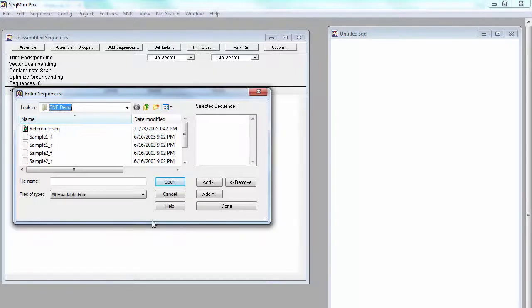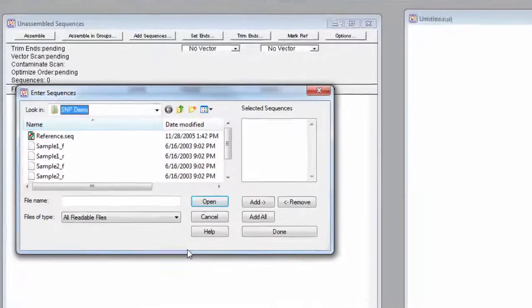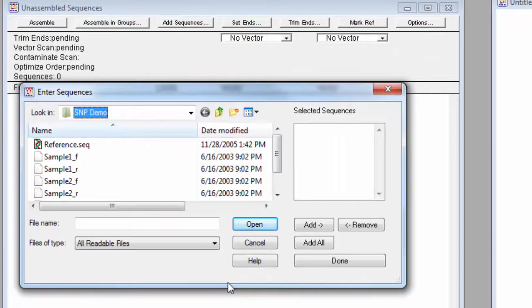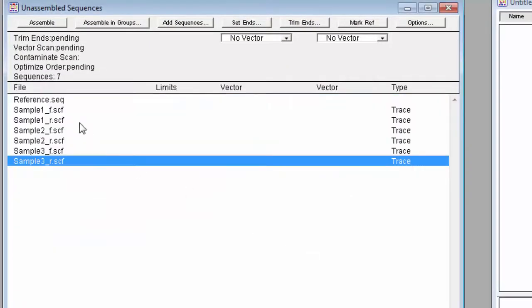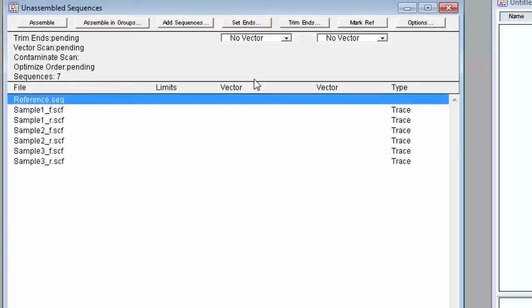You can also use the Molecular Biology Suite to assemble contigs of Sanger sequences, either de novo or against one or more reference sequences.